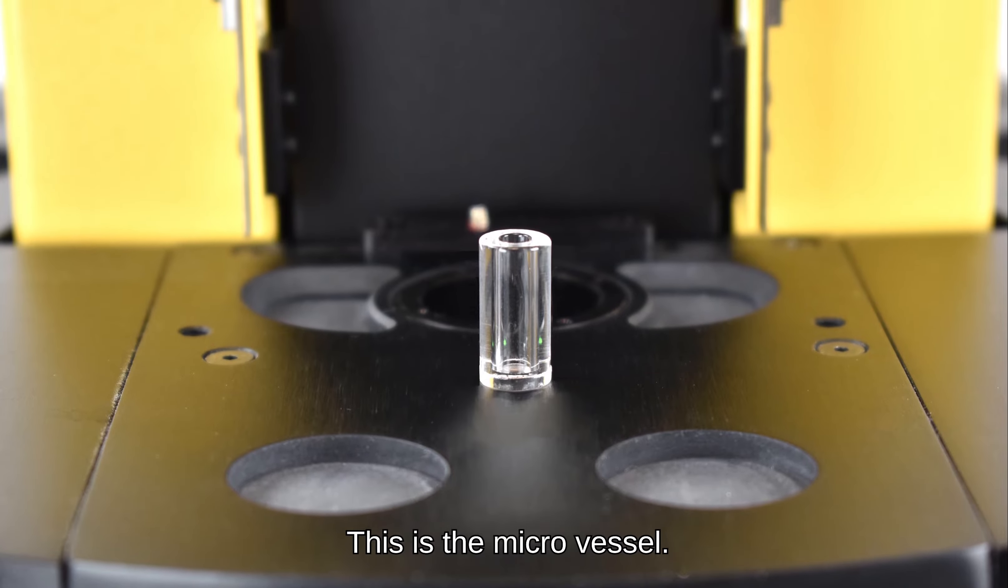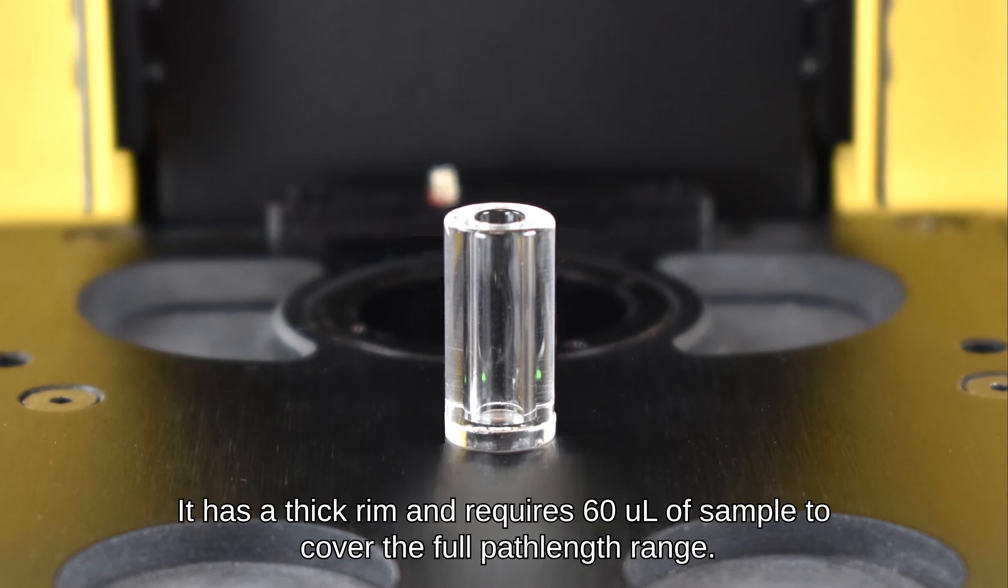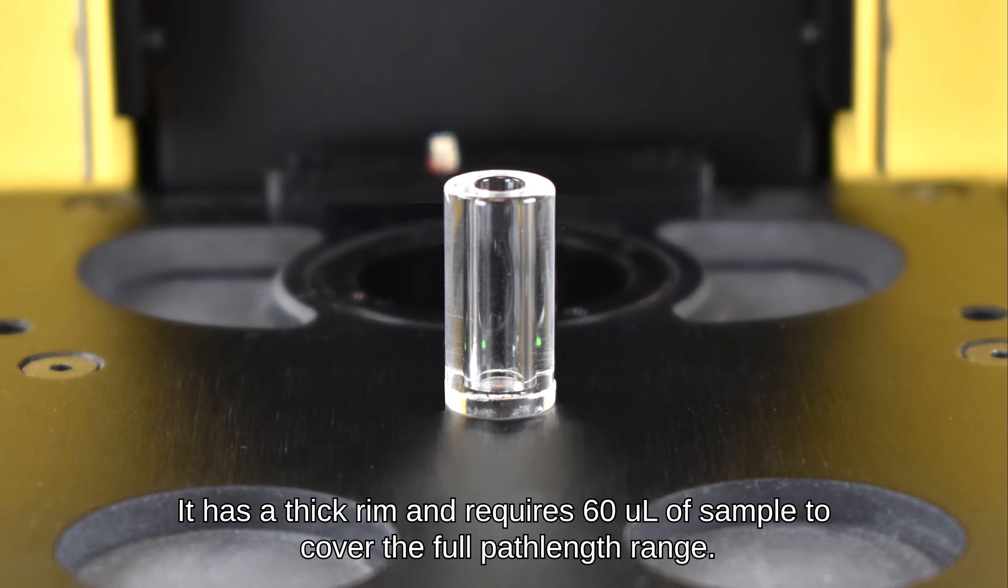This is the micro vessel. It has a thick rim and requires 60 microliters of sample to cover the full path length range.